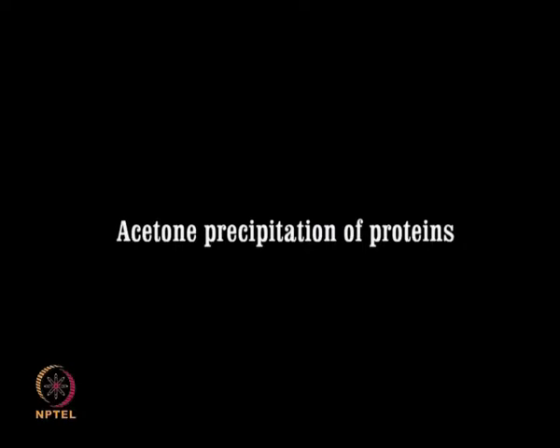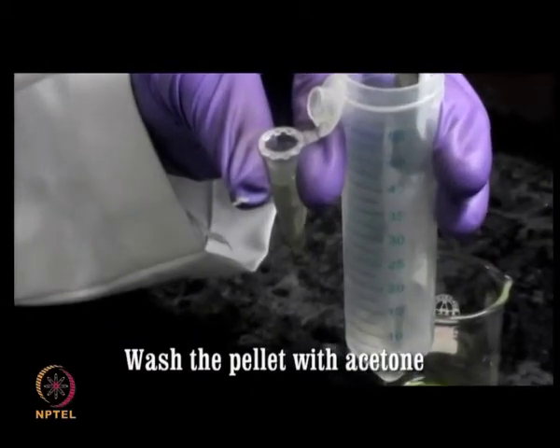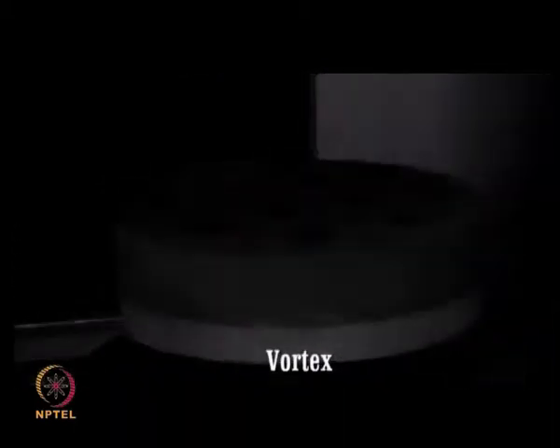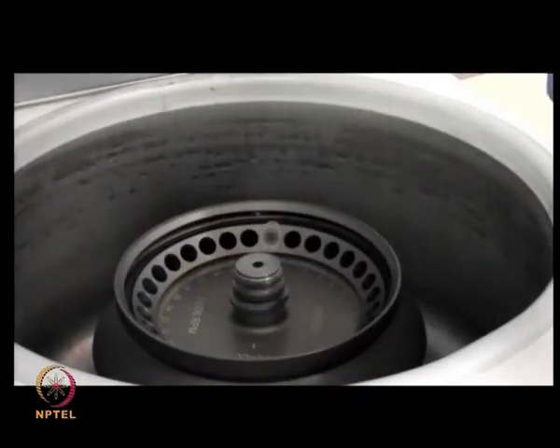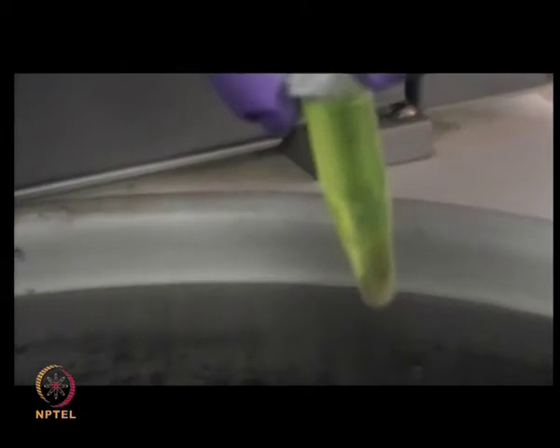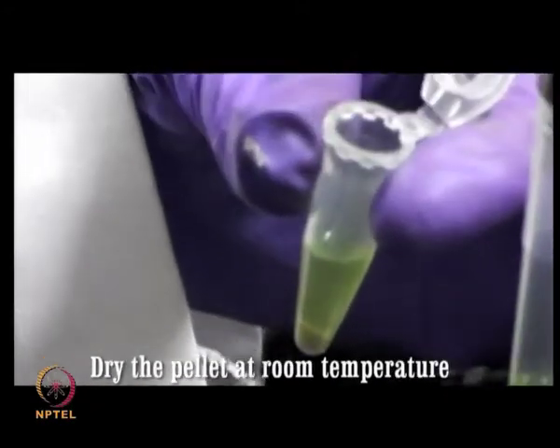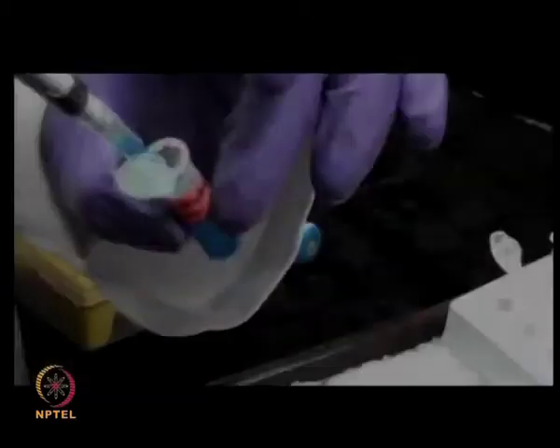Protein precipitation. Remove the pellet from -20 degrees Celsius and add chilled acetone to it. Mix the sample well by vortexing to obtain a uniform solution. Centrifuge the contents at 4 degrees Celsius for 5 minutes at a speed of 10,000 rpm. Discard the supernatant and repeat the acetone washing at least 3 times to remove all plant pigments. Obtain protein pellet at room temperature.